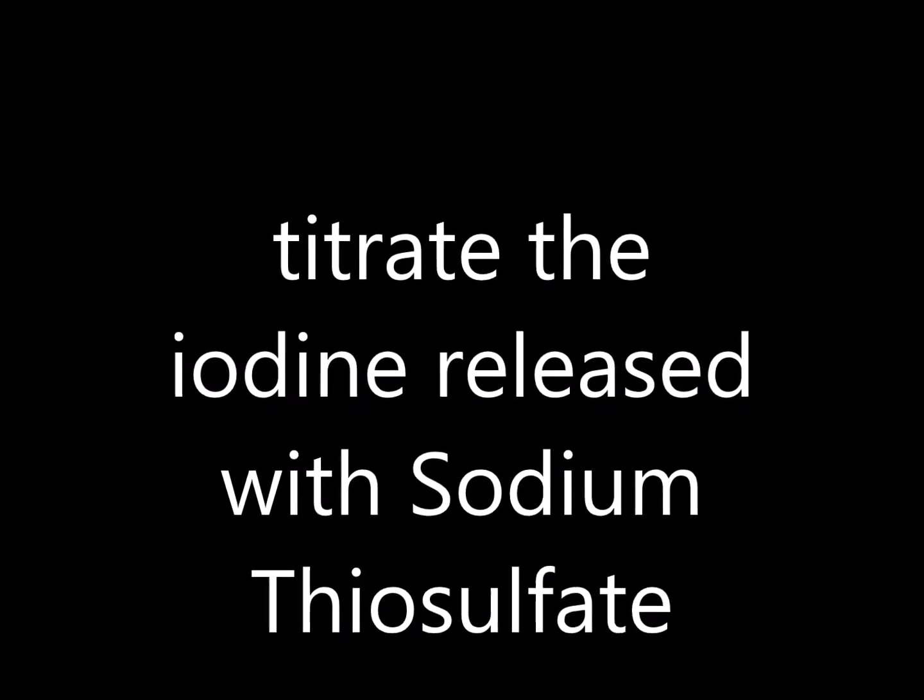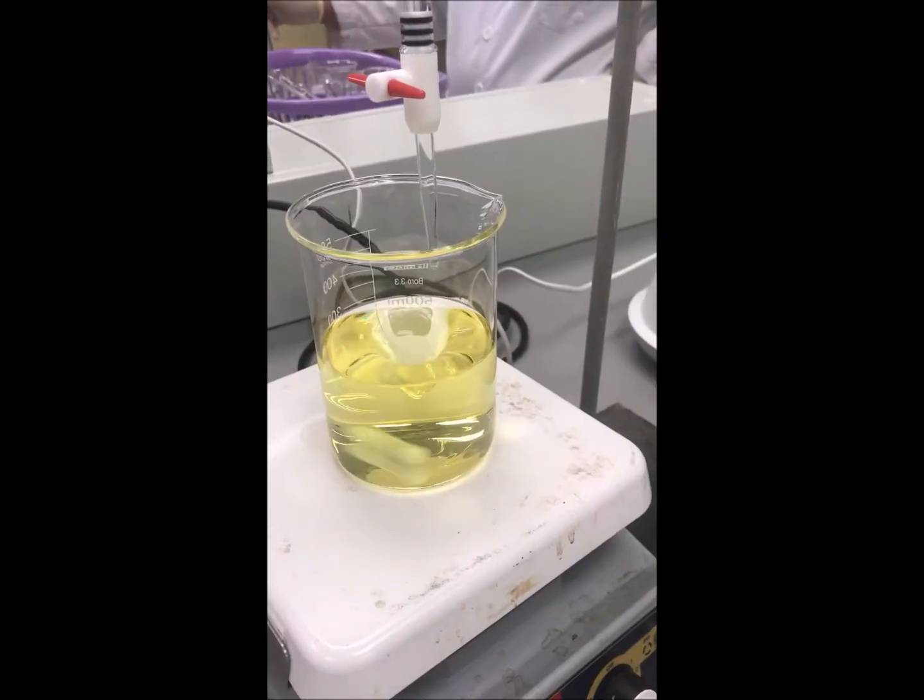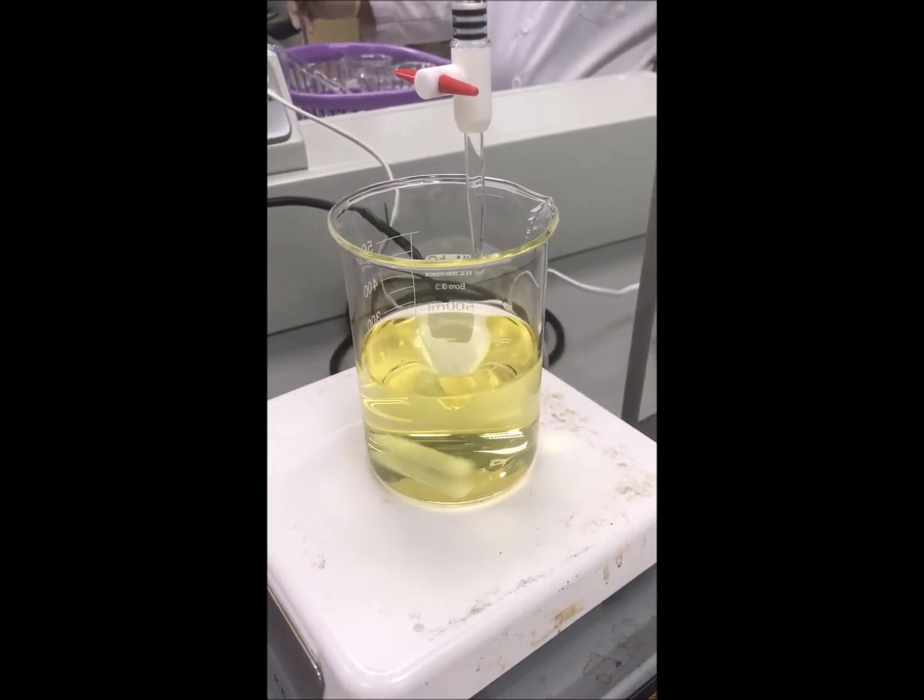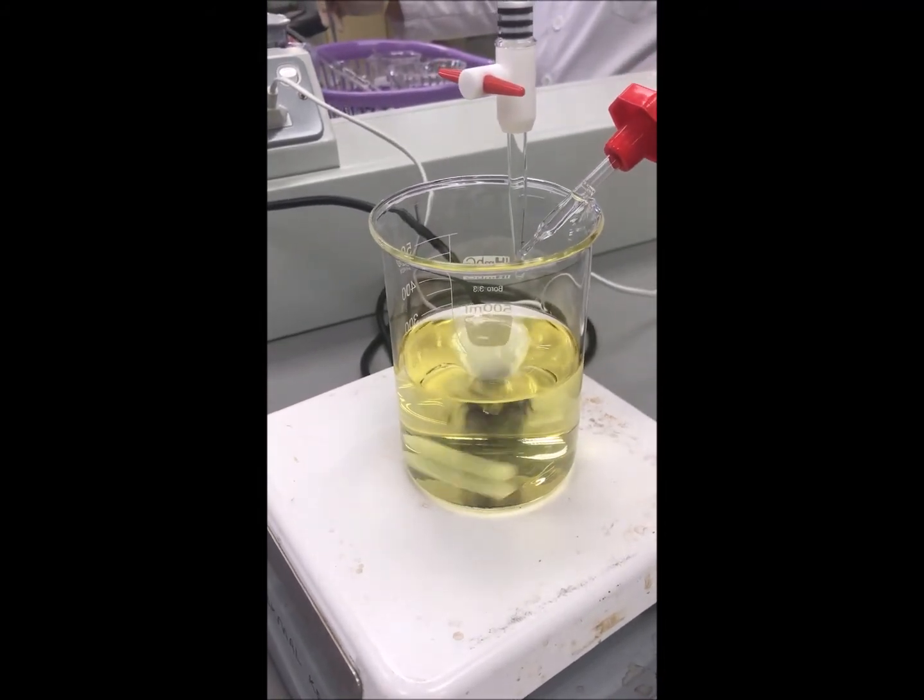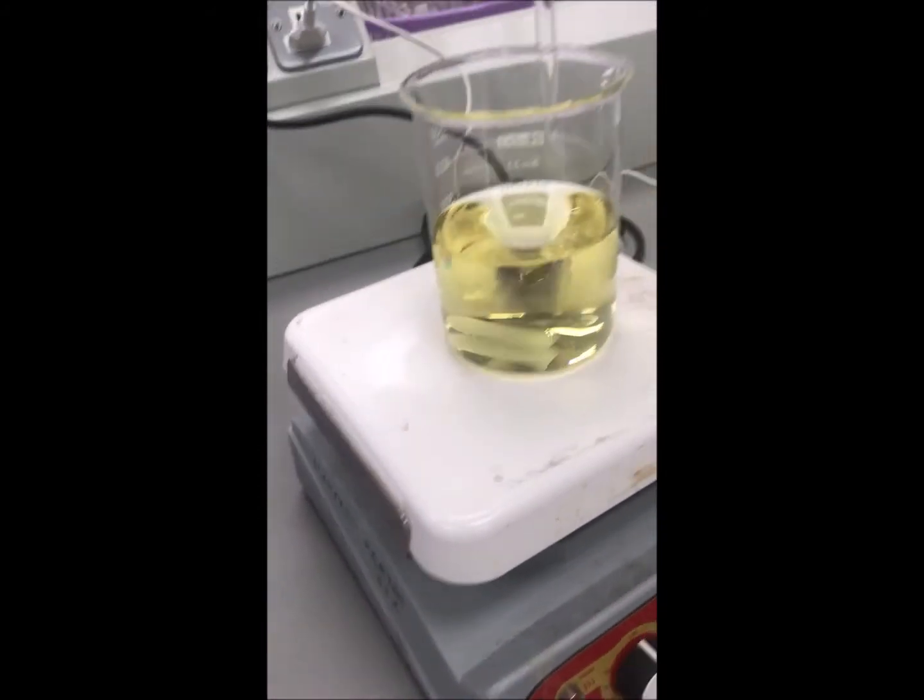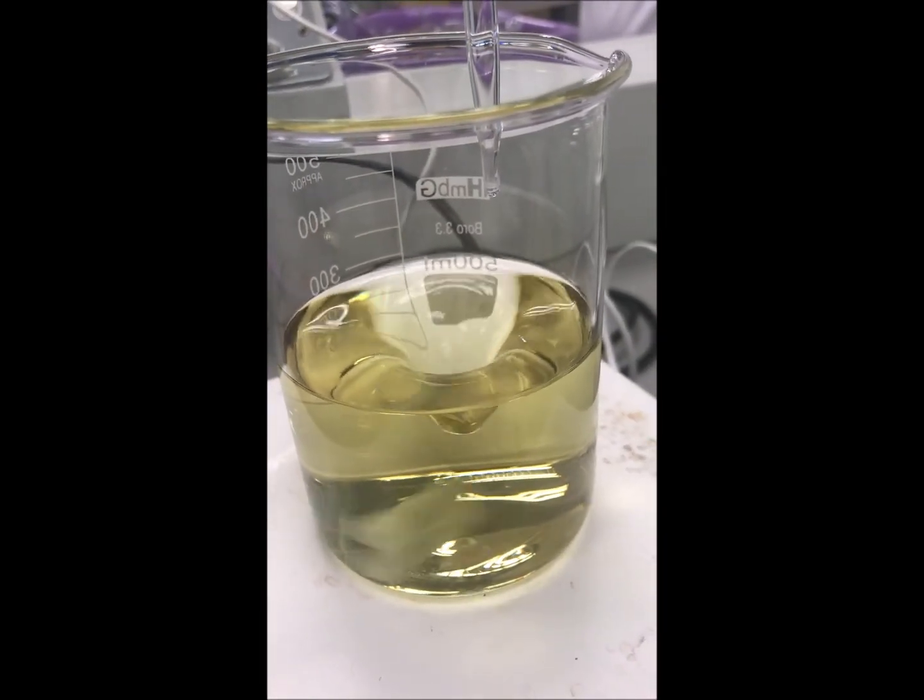Then, immediately titrate the iodine released with the sodium thiosulfate solution. When the color of the mixture becomes yellowish, add in 1 to 2 drops of starch solution and continue the titration until the dark blue color disappears.